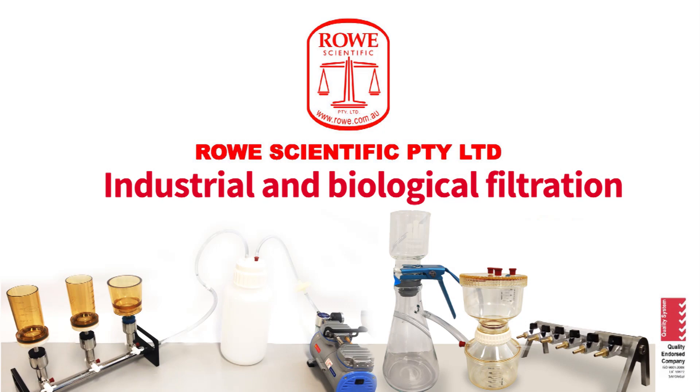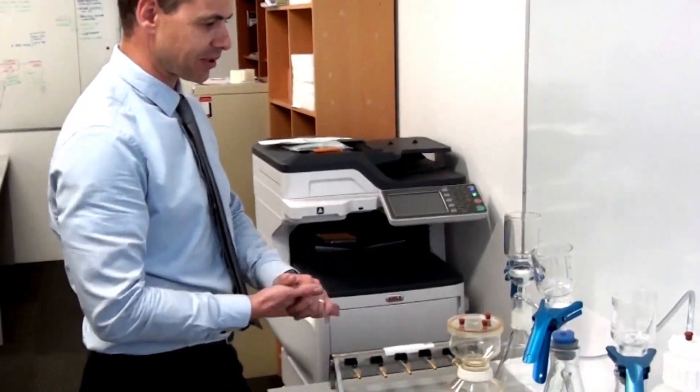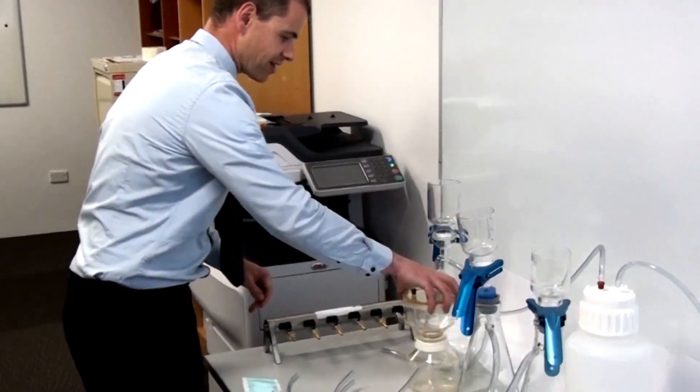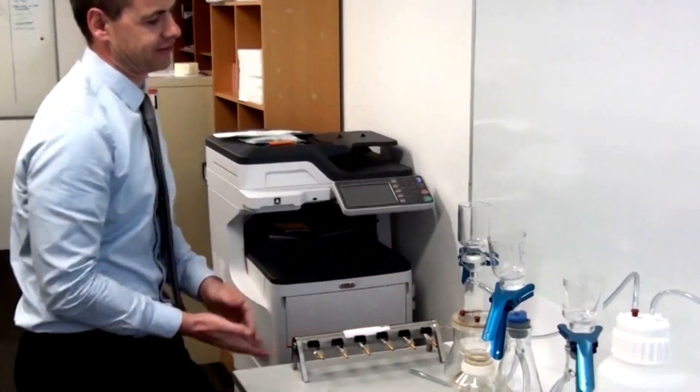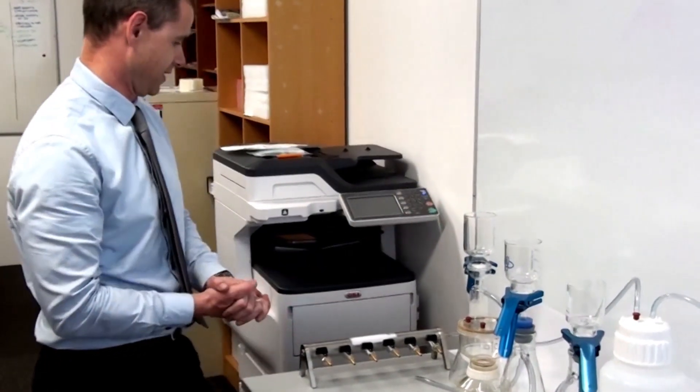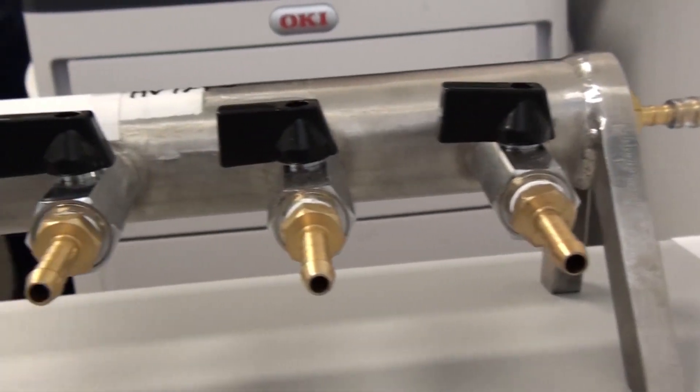Okay, we're setting up the 6-place industrial manifold. I've prepared everything and I'll just quickly run through how we set it up. I've got various filtration setups here, four different types, different brands. So starting with the manifold itself, starting from the left I'll just work through to the right.